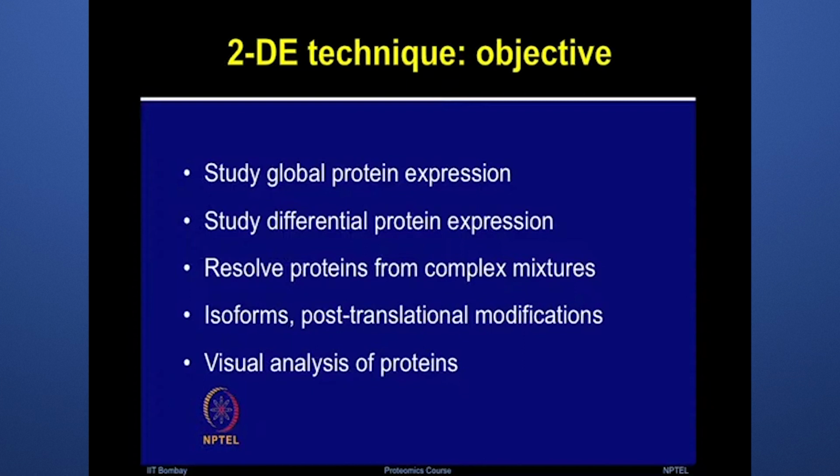In this case, all the protein spots are already present and you can visualize that, and then you can use each of these spots to further analyze and compare the images.